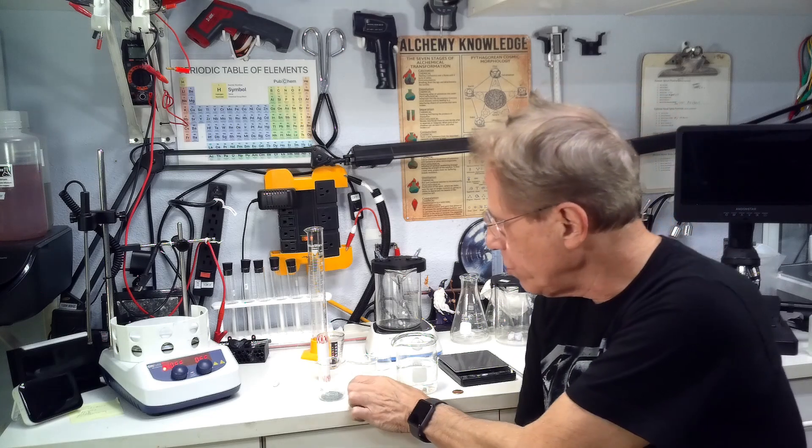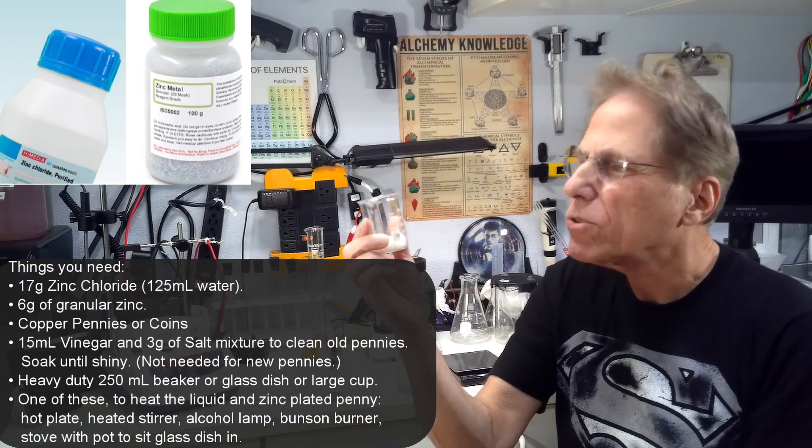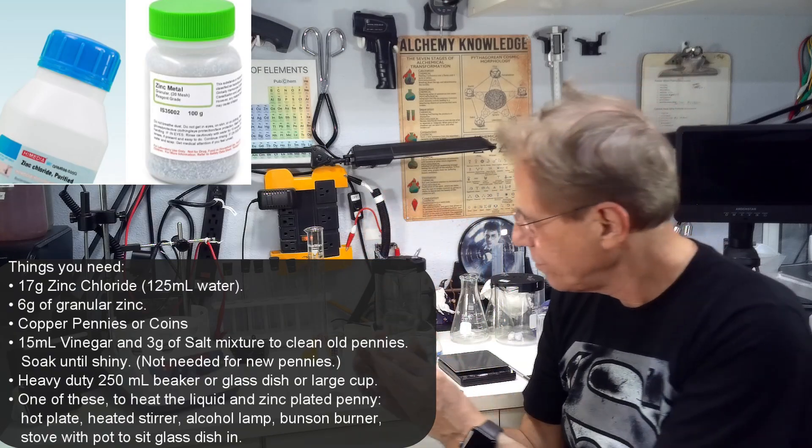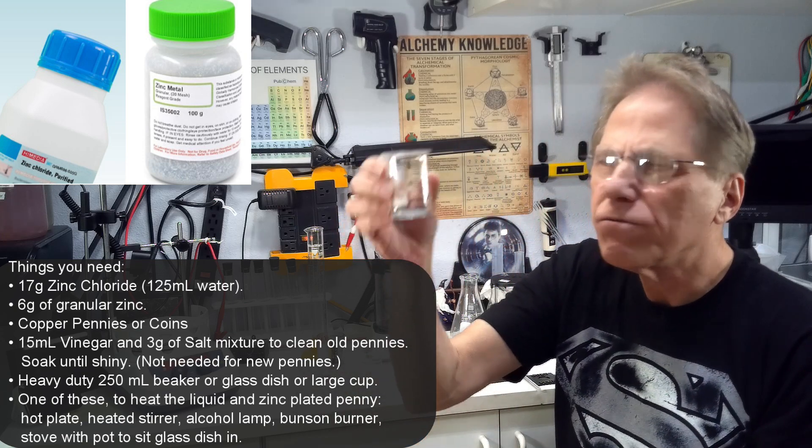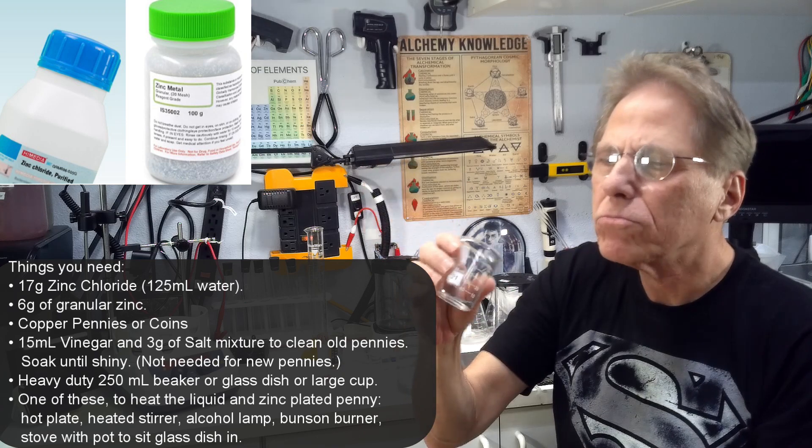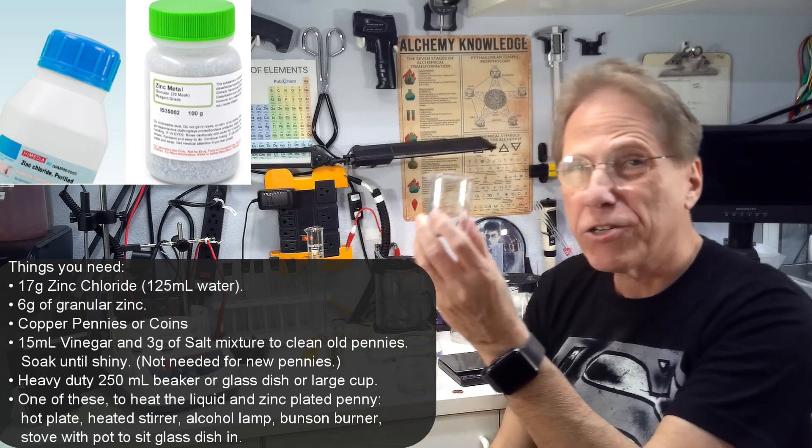To accomplish this magical process, we're going to use some chemicals. We're going to use 17 grams of zinc chloride. We're also going to use 6 grams of zinc granules, dust, basically ground up zinc.